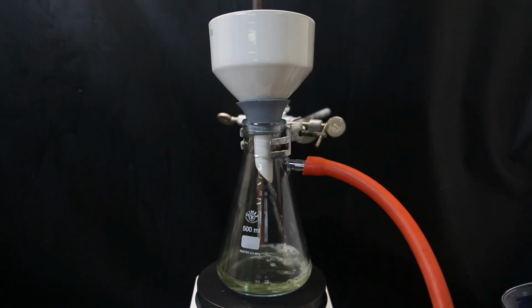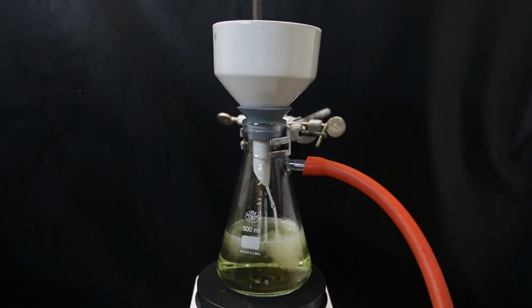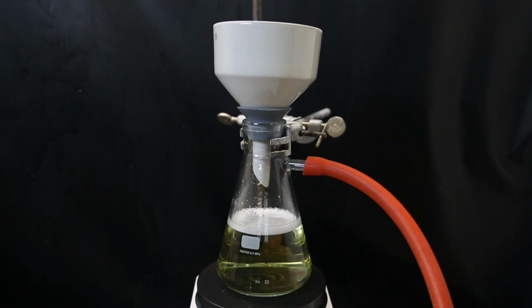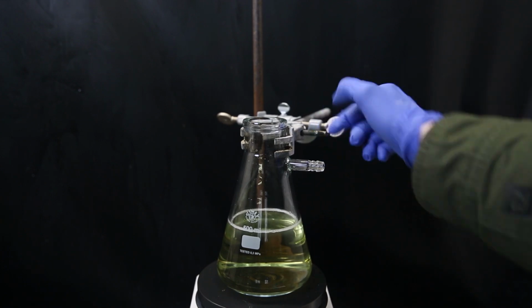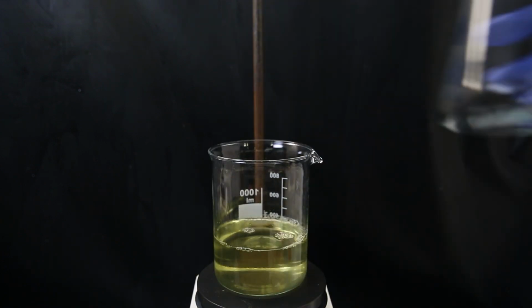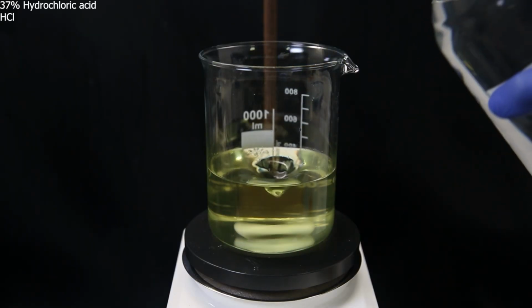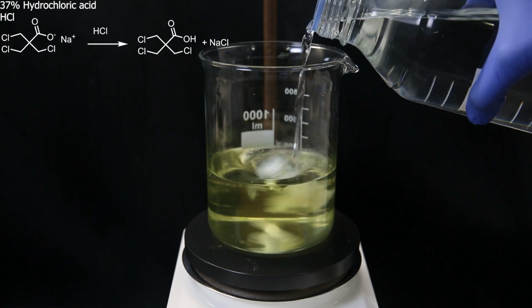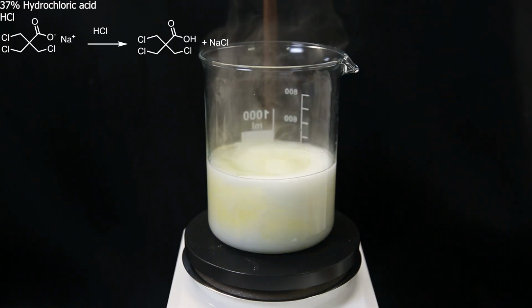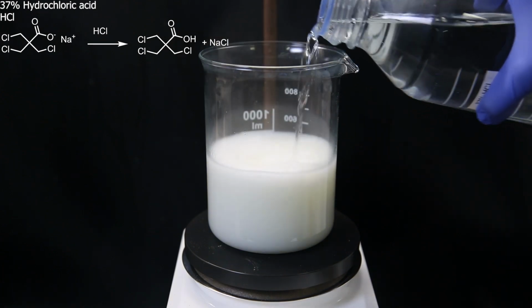Then, I set it up for vacuum filtration to filter out all of the tetrachloro, which hasn't dissolved. I don't have use for the tetrachloro, so I just throw it away and take the filtrate with the dissolved product. I put it all into a beaker and wash the flask with some water. I then drop in a stir bar and start adding in a random amount of 37% hydrochloric acid to precipitate the free acid product. It immediately precipitates as a white solid, and I add a little bit more acid to make sure it has all reacted.